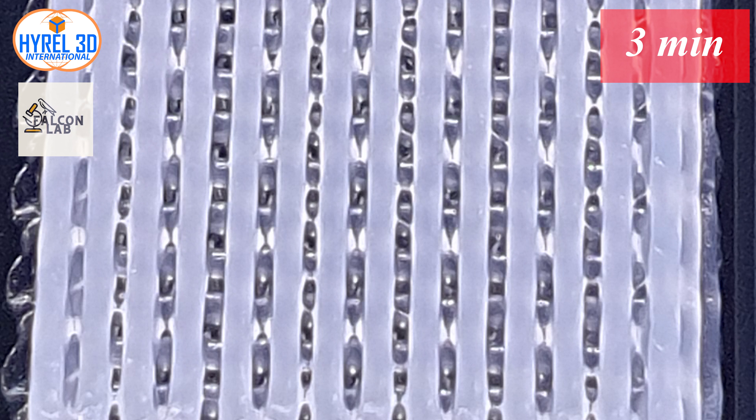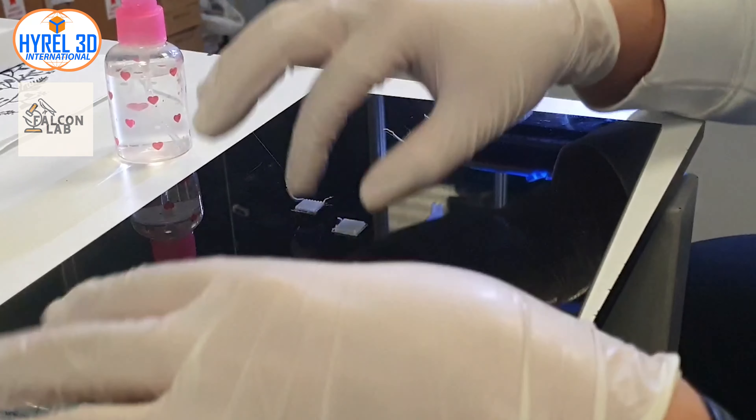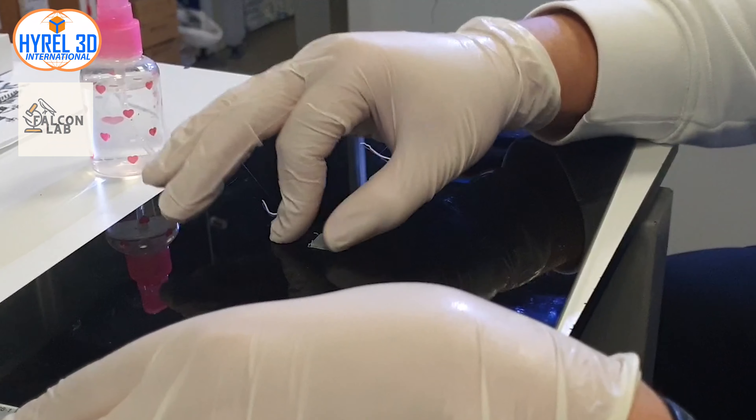When you reach the third minute, you will notice the complete whiteness of the top surface of the scaffold clearly. On the other hand, the inner layers may still be transparent and need more time. I would suggest waiting one minute for each printed layer — for example, a five-layer scaffold would need five minutes to be fully cured and hardened.